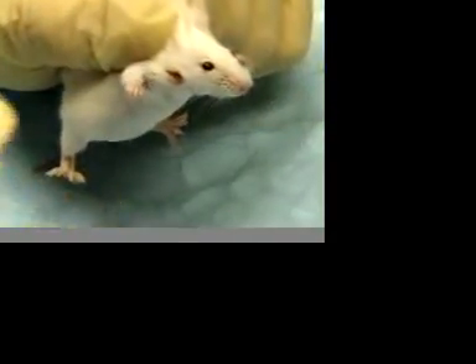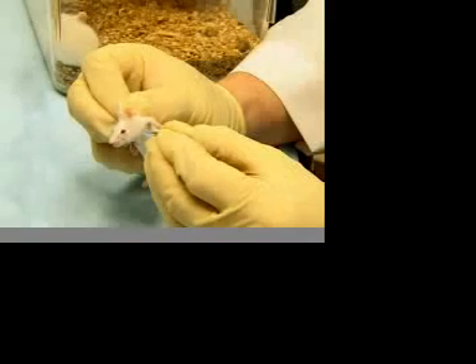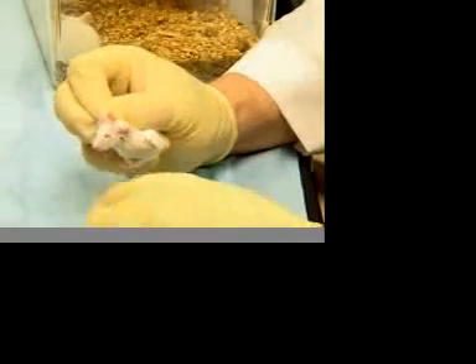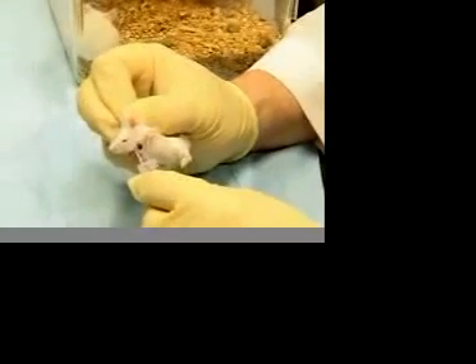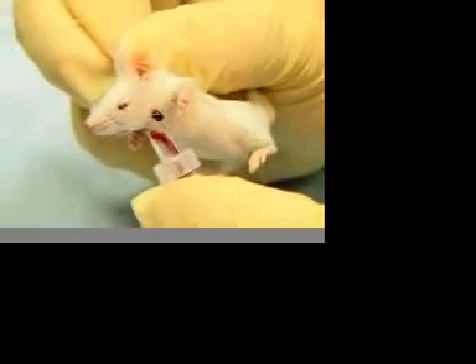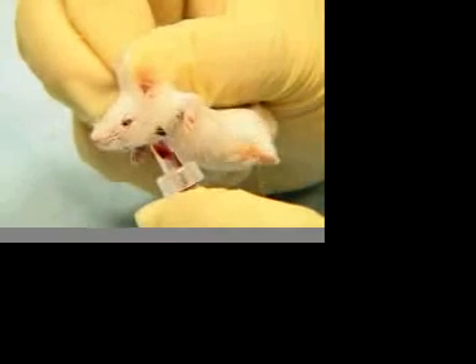Blood flow can be stopped at any time by applying a compress to the puncture site. In this demonstration, we missed the first drop but still collected a half mil of blood, although we could have stopped the blood flow at any time by applying a compress. Always be careful that the amount of blood collected is within the PHS guidelines for the size animal you are using.